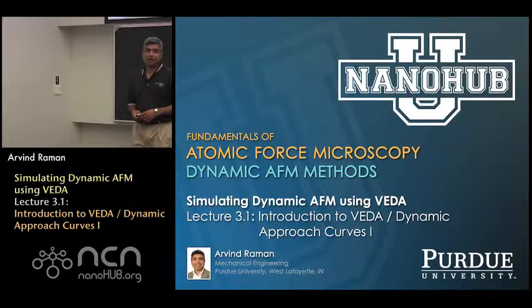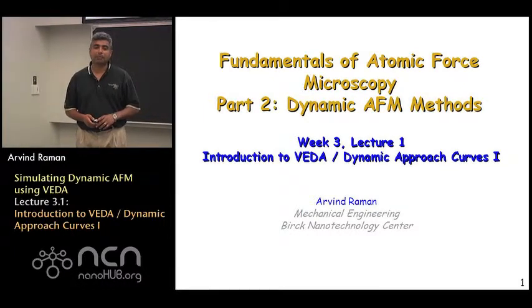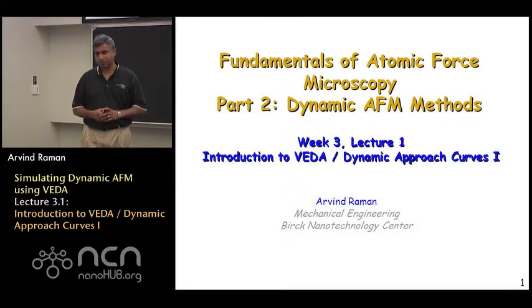nanoHUB-U, online instruction. Hi, and welcome to Week 3, Lecture 1 of Dynamic Atomic Force Microscopy Methods. In Week 2, we had gone over many analytical aspects of dynamic atomic force microscopy.